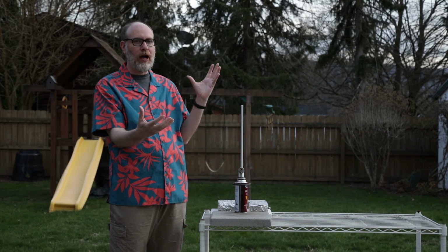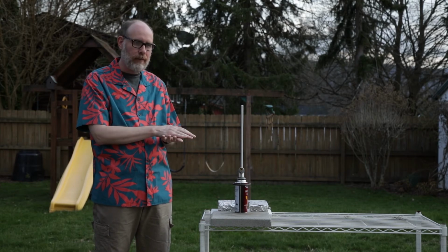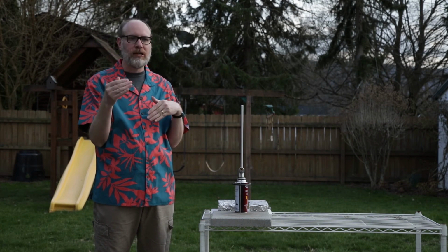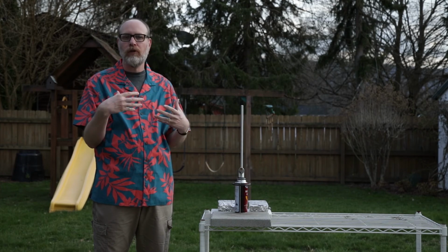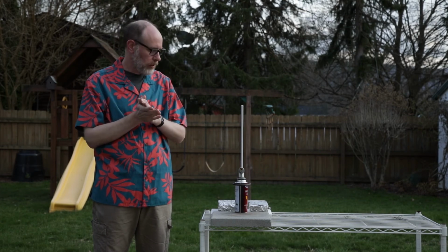There's going to be plenty of oxidizer around. There's going to be plenty of fuel in the alcohol that we're injecting into the flame. Then the flame is going to provide that heat source. That's going to cause the electrons in those metal ions to go to the excited state. When they come back down to the ground state, they will emit a particular color of light. We call that atomic emission.